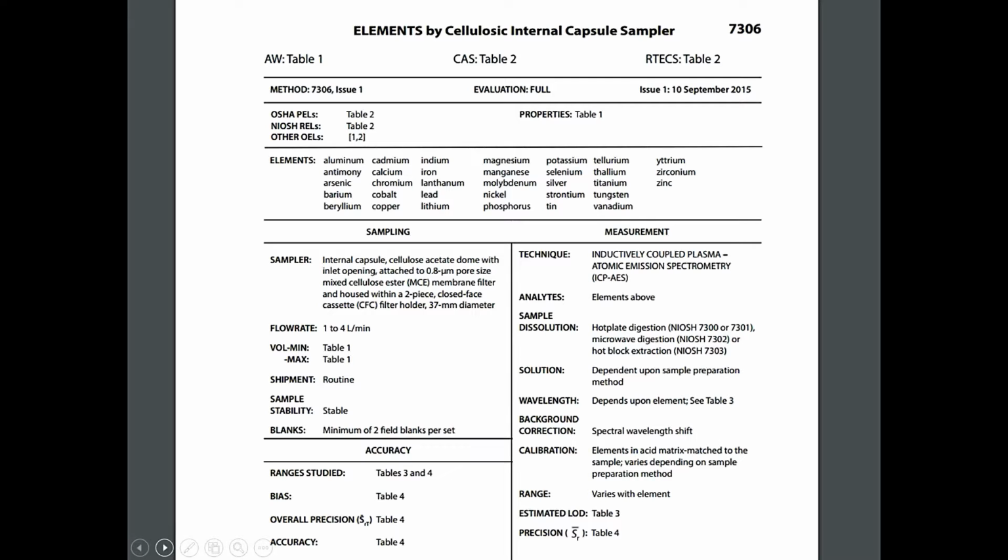So again, I know in Australia the IOM is the standard, but we're having a transcontinental exchange of information. So I wanted to let you know of some of the things we have over here in the States and what NIOSH's thoughts were behind it. They're really set on having an inexpensive, disposable sampler that eliminates these wall losses.